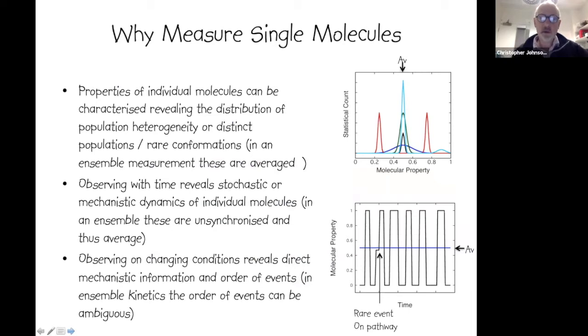Okay, so the first question that you might ask yourself is why would you want to measure single molecules? You may be working in the lab with a few microliters or a mil of a solution of your molecule of interest at micromole level or thereabouts. And within that sample, you have 10 to the 12 to 10 to the 15 molecules. And so when you're making your measurements with that sample, you may stand there and think, do I really want to make these measurements 10 to the 12 or 10 to the 15 times harder to do?